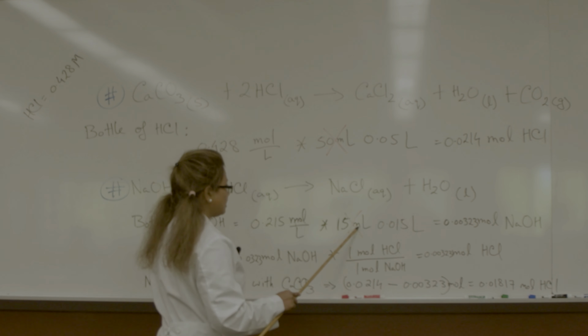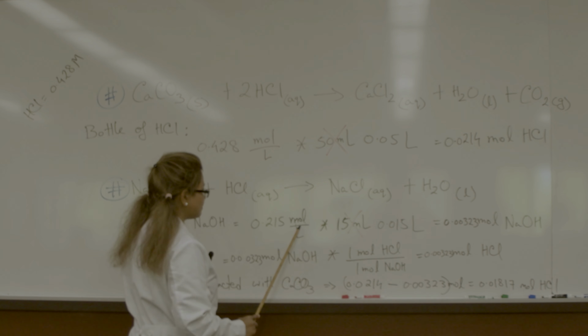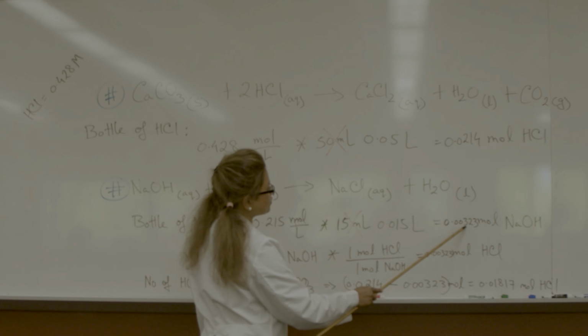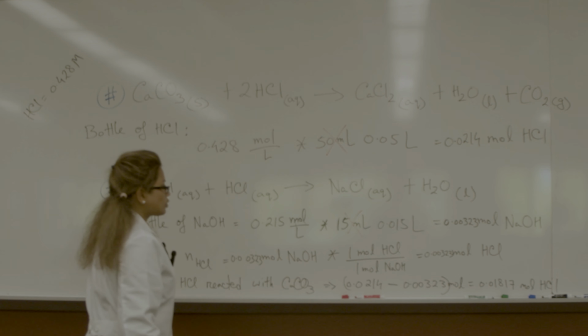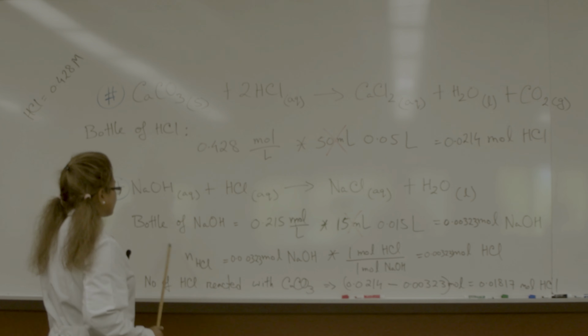So same thing, I have to convert milliliters to liters so that I can cancel my liter and get my mole. So after doing the calculation, I get 0.00323 mole of sodium hydroxide that I have used in this experiment.